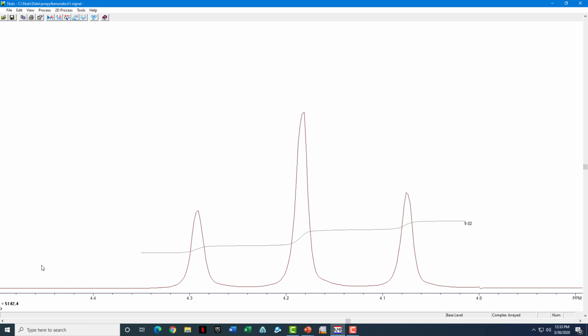This sample that we did today is an example that's very concentrated. This propylbenzoate sample is 98% with a little bit of TMS in it. What we would like to find out is, how does this experiment come out if we're doing moderately concentrated samples or dilute samples? Is there going to be a change? What if we change the pulse width from 90 degrees to 45 degrees? There are several data sets in the data folder for you to work on and learn a little bit more about how signal and signal to noise scale with the number of scans based on concentration.